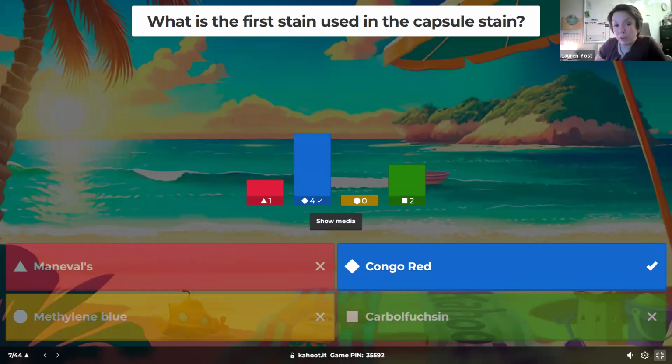And if you can't really see the greenish there, but you see that the reds are there, you can use the fine adjustment knobs on your microscope to see if you can catch that green in those little circles. And if you do, then you know that this is the endospore stain. Yeah, I do expect you to do that. Number one most missed question by far is that one. And I'm not dropping it.